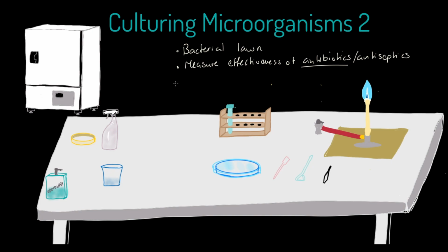And finally, in order to do that, we are going to measure what we call a zone of inhibition. And we're going to use the same formula we would use in maths to measure the area of a circle, which you probably know is pi r squared, and we'll come to that in a few moments' time. So this is kind of what we want to get to.